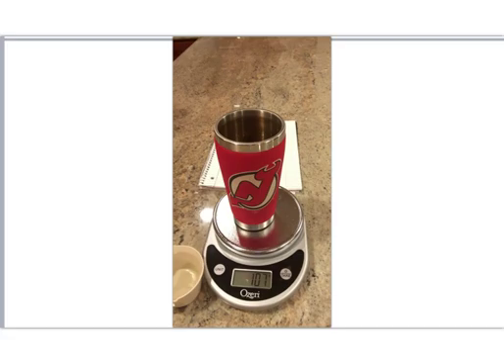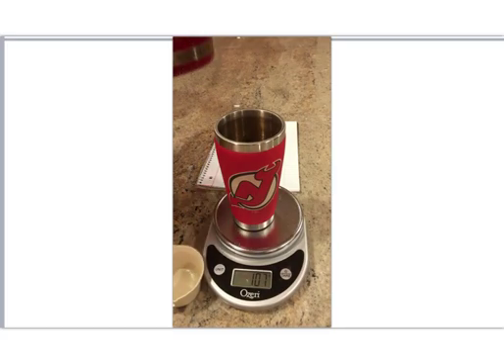So it's reading 100 degrees, so the hot temperature is 100 degrees Celsius. 100.0 actually it read. And I'm going to bring the teapot over now and put the same amount of water in.